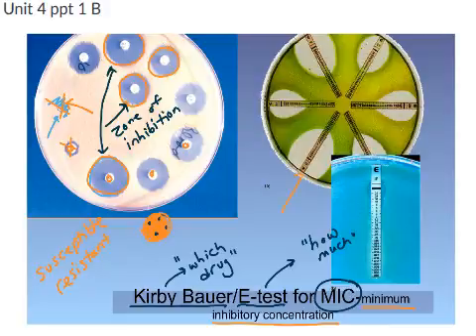So if you take a look at this Petri plate up here, all of these strips contain a specific type of antibiotic, and it's at different amounts at each level. So you actually purchase these. This is not something you make in the lab. And then the larger the zone right here, you would know that whatever concentration you're looking at in this area is a lot more effective than, say, this area where the green is showing the bacterial growth. That looks like Pseudomonas aeruginosa on that plate. It's not killing it off.